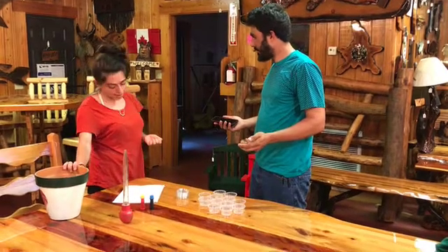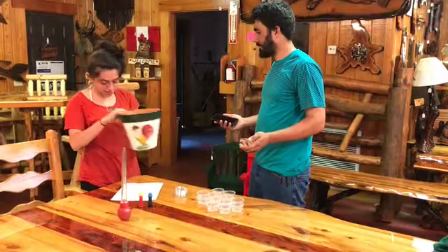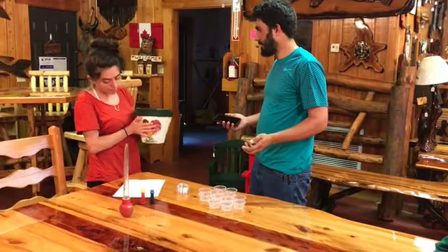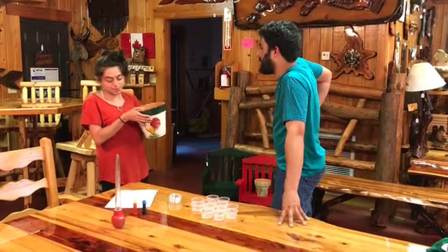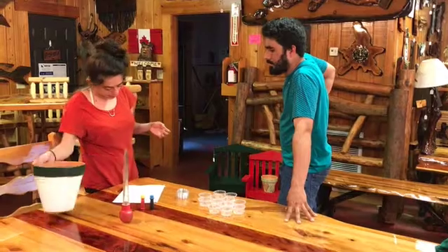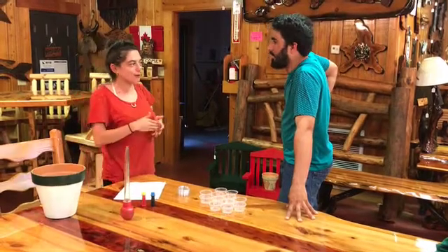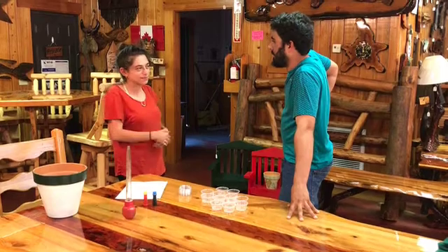Spectrophotometry is a way to measure how much light is being absorbed by a substance, and it works by measuring the intensity of a beam of light as it passes through a liquid or sample. This is how we're going to determine the amount or concentration of protein in our sample.